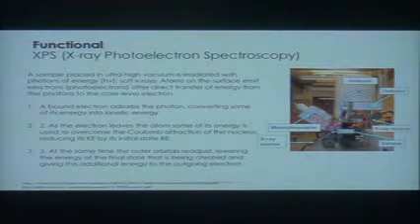And so you take a spectrum. That spectrum is going to go across a sweep of energy ranges that you can control as the user. And then you say, well, okay, I saw a peak in the energy spectrum of the electrons that I measured coming out, and that peak would correspond to this kind of bond. All right, so that's the general idea.